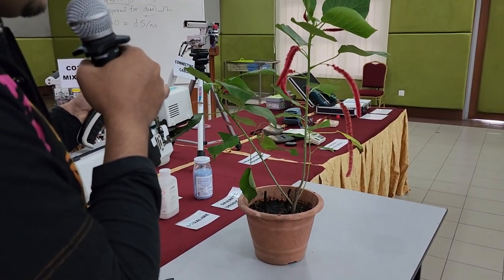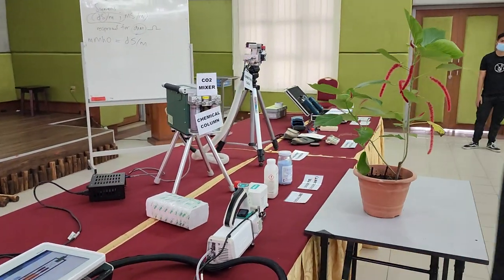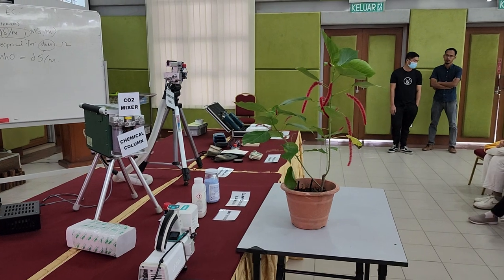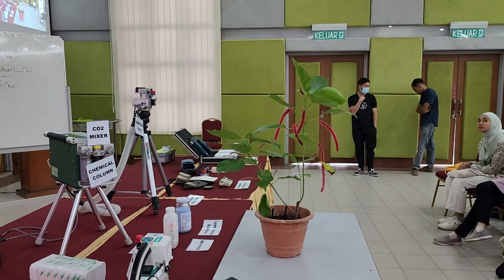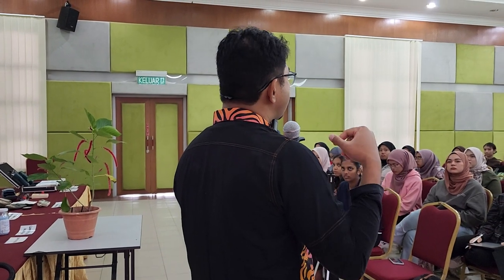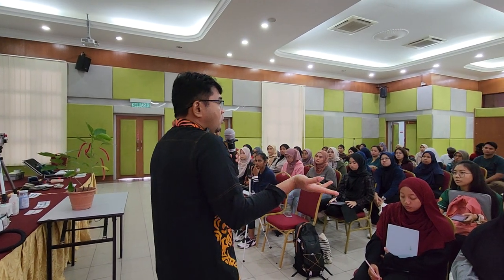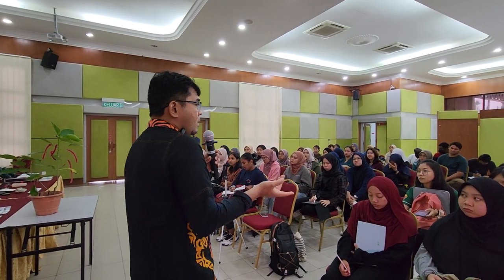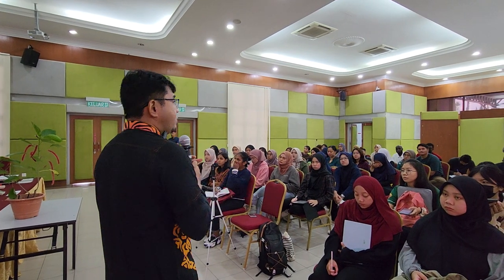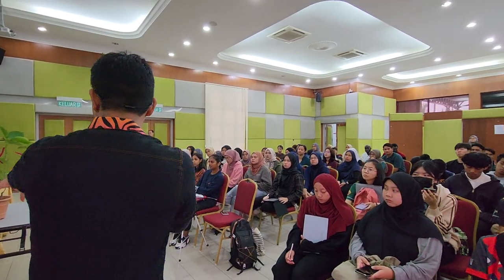Right, and then when the leaf is being clamped inside, this is a separate world now. And in this world, you can control what the plant is experiencing. Do you want the plant to experience the way it is now, or do you want the plant to experience some kind of hypothetical situation? Maybe let's make the plant experience 2050 CO2. In 2050, the CO2 is going to be 800 ppm. Who knows, right? You don't have a time machine, but you have this machine, right? So we make the plant experience the future CO2 concentration by clamping it inside here.